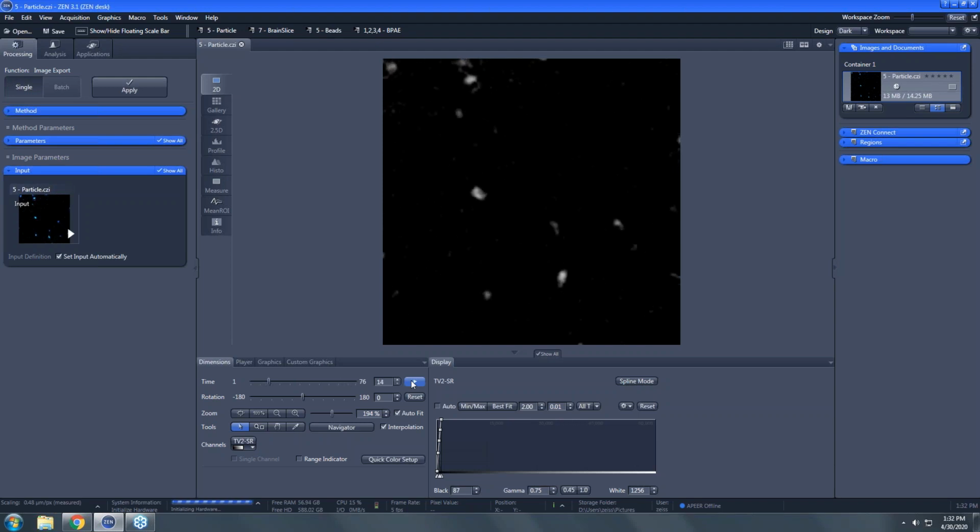particles are moving. In particular, we've cropped in after Nicole did some trial and error and some picking of particles. We've cropped in on this one that's traveling from kind of 6 o'clock to 11 o'clock vertically. You might see that. So Nicole's going to draw a profile line that proceeds along the path of movement of this particle.